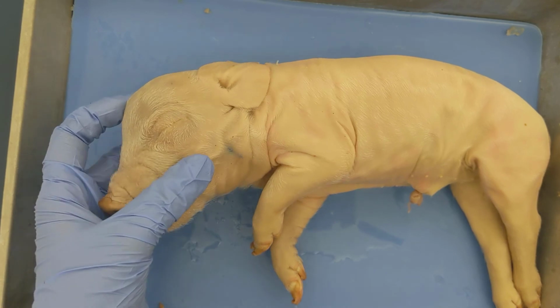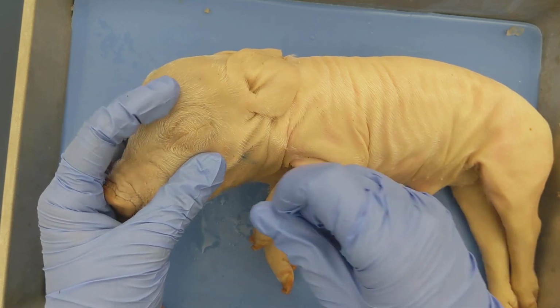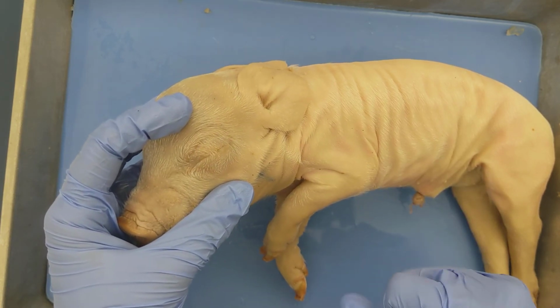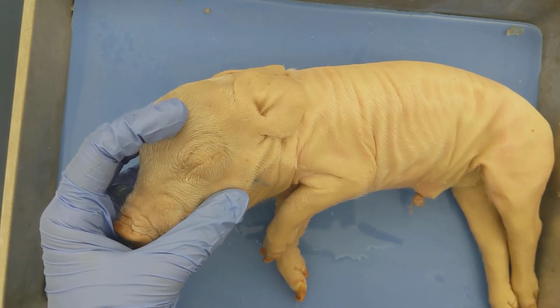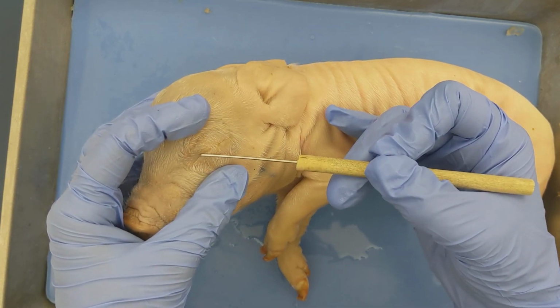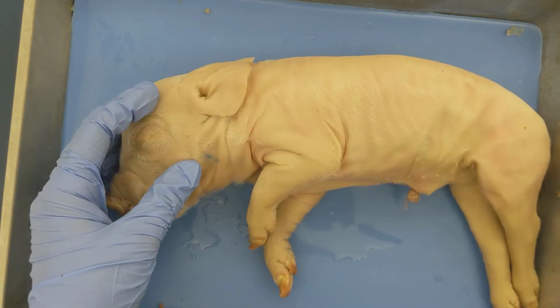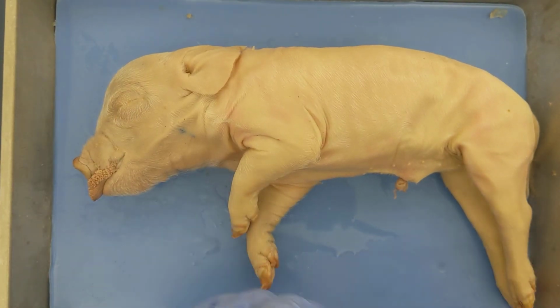Okay. And then our pig also has eyes. The eyes are closed, and for those of you who might be a little squeamish, I'm not going to open them up. But pigs actually have not just the regular set of eyelids that you and I have, they have another set of eyelids called the nictitating membrane. And that nictitating membrane, there's a third eyelid. It's actually in the corner of the pig's eye here. Again, you can't really see it because the eye is closed. I'm not going to open it up. But that nictitating membrane kind of closes this way, right? And we see that in some animal groups, some mammal groups specifically. We as humans do not have it.